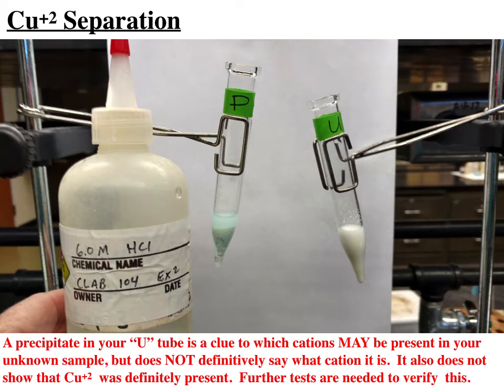Here are the two centrifuge tubes, P and U, after the addition of the 6 molar HCl. Now what we note clearly is that each of them has formed a precipitate. But to be completely honest with you, we haven't solved our puzzle yet. Certainly this is true. We knew for a fact to start with that the practice tube had all the ions, so for sure the practice tube should have shown a precipitate.